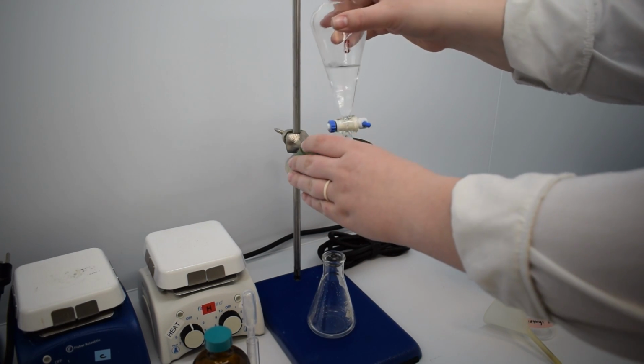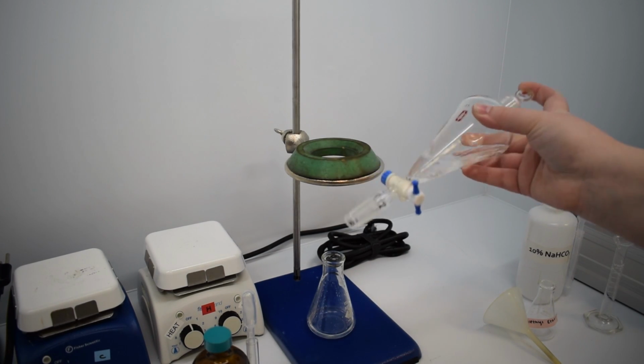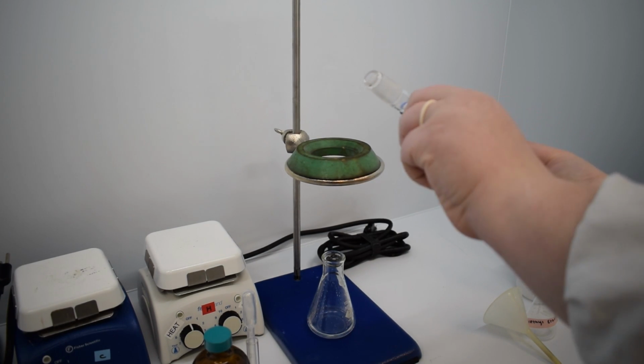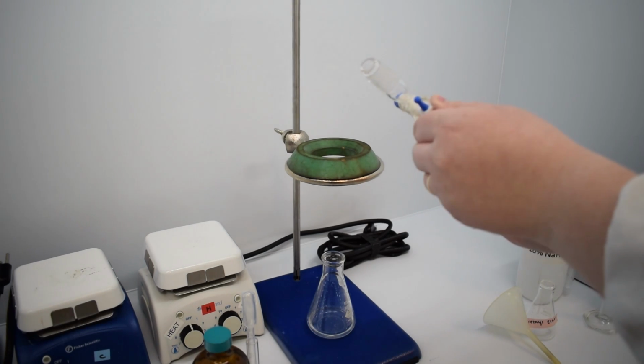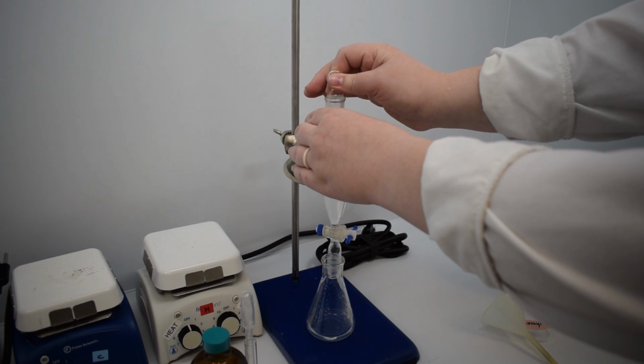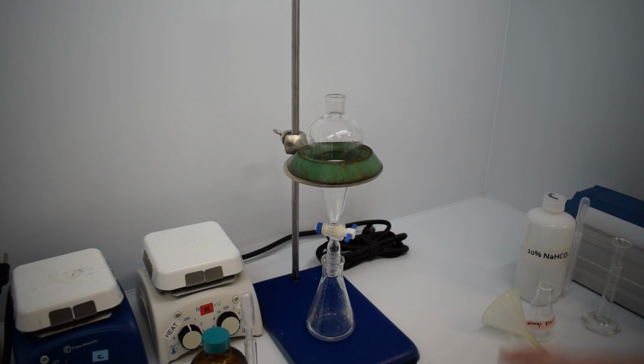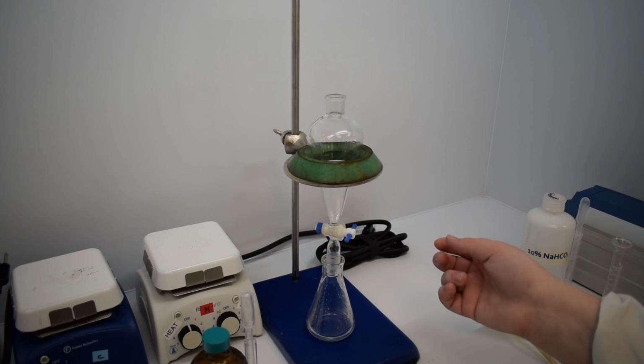The purpose of this extraction is twofold. First of all, you started out with a lot of acid in your reaction flask, so you need to neutralize it using a base. That's why we use sodium bicarbonate. You also want to isolate your compound in the organic layer, which is why we add diethyl ether, our organic solvent.